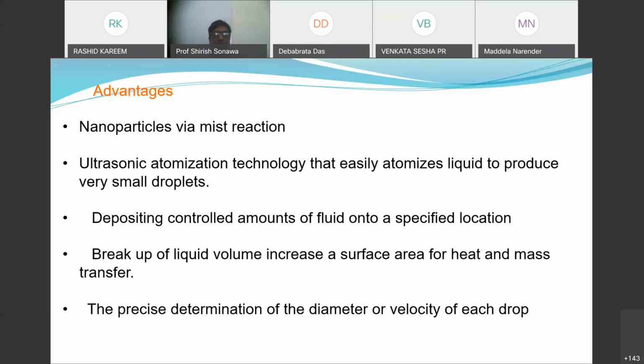It is basically based on the mechanism of how the ultrasound probe works, like Ashok might have shown you in the morning. In the ultrasound probe itself, the liquid comes through the probe, and through the probe the atomization happens, and the liquid is flushed out from the orifice once it is deposited onto the tip surface, and then you will get a uniform smaller droplet size.